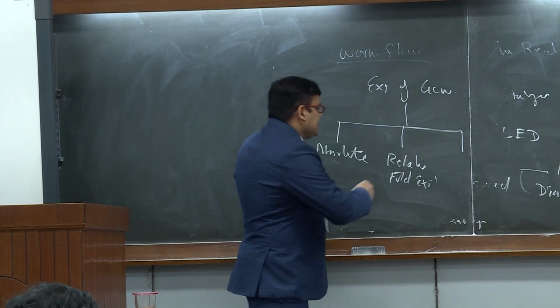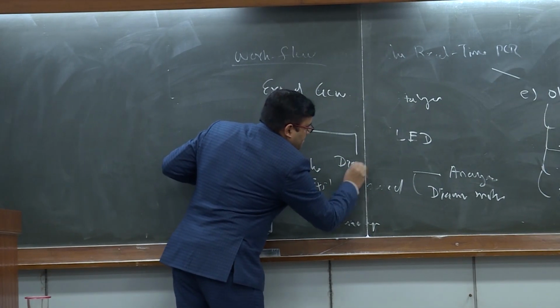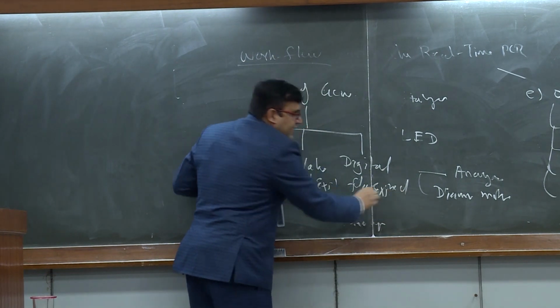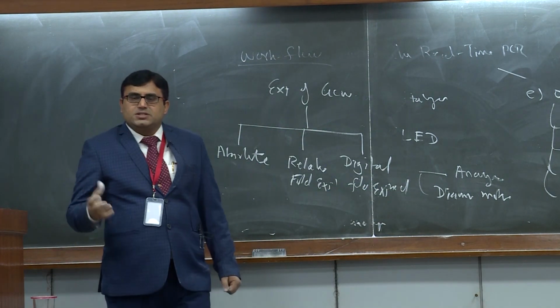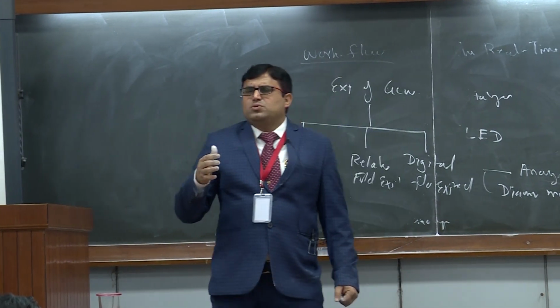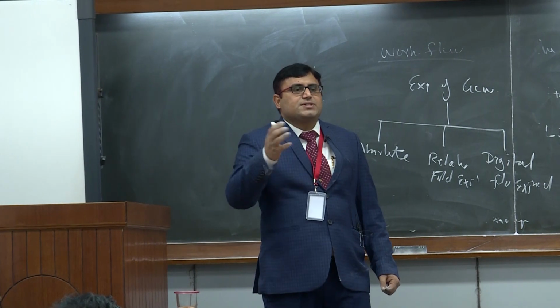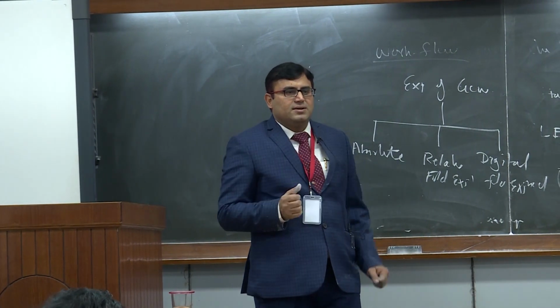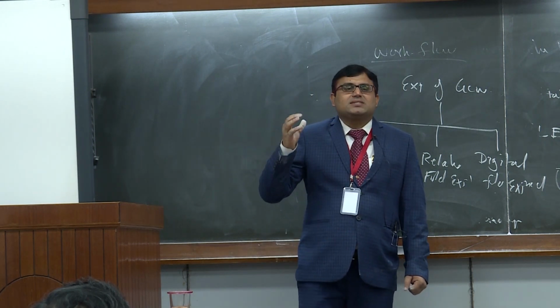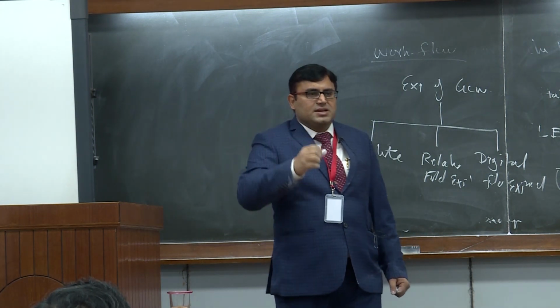And the third one is digital fold expression. Digital fold expression means we are doing transcriptome, right? And we are getting more than crores or lakhs of transcripts in our data. Now, suppose there is a gene X and gene X has, let us take, 100 transcripts.